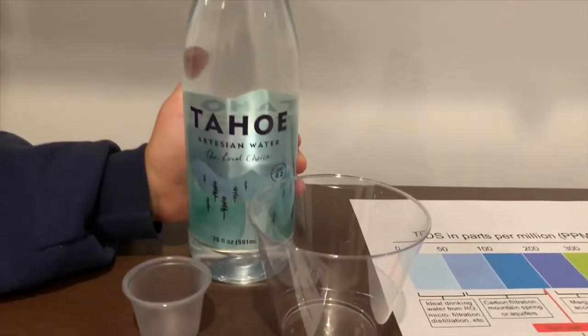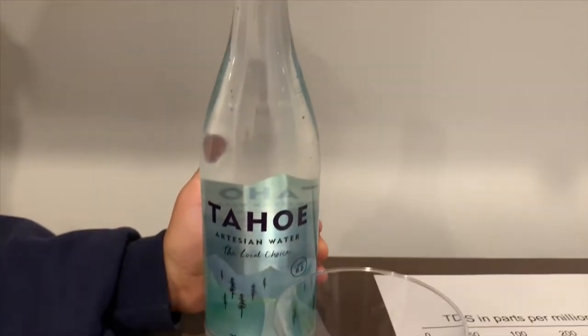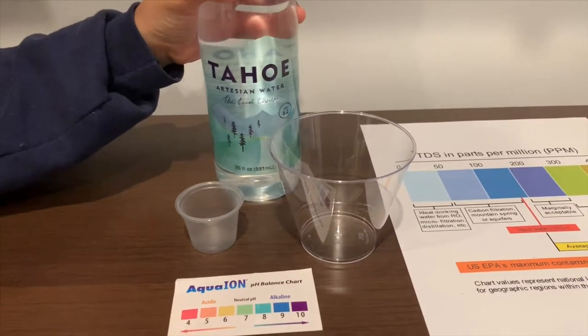This is Tahoe artesian water, sourced from Tahoe National Forest. Let's test the pH and TDS levels.